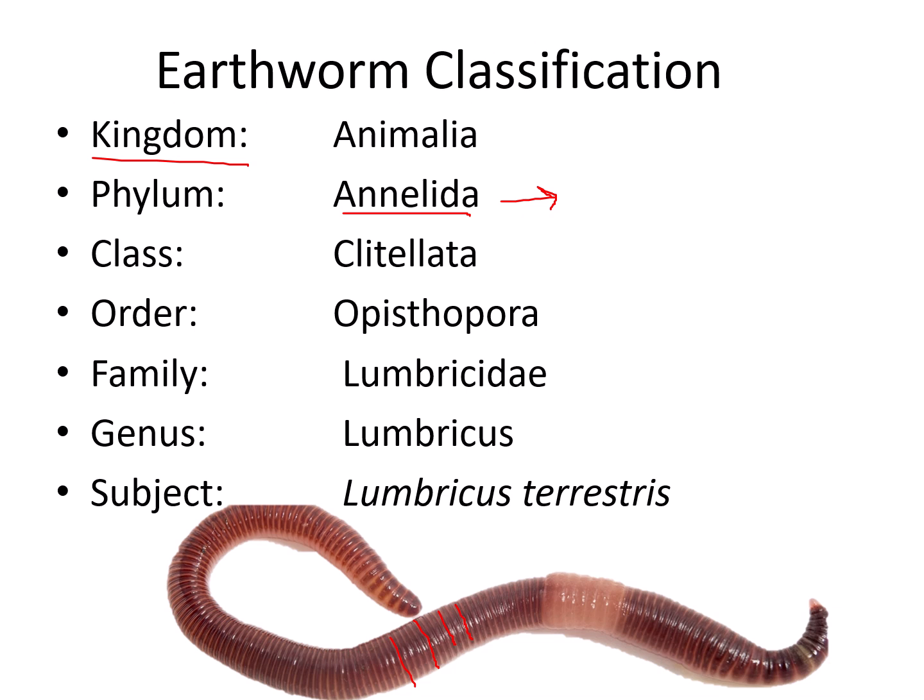The class is Clitellata. Members of this class have a broad saddle-like clitellum on their body. For example, we can see in this earthworm specimen that at the center toward the anterior side there is a saddle-like, broader area, and this area is actually glandular. It will secrete sticky secretions, and we'll see its function later on. So if a clitellum is present on annelids, then they are classified in class Clitellata.